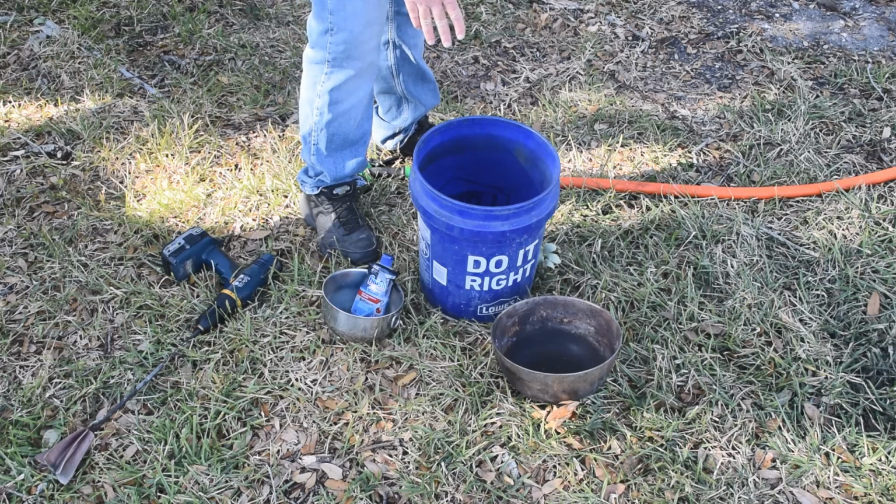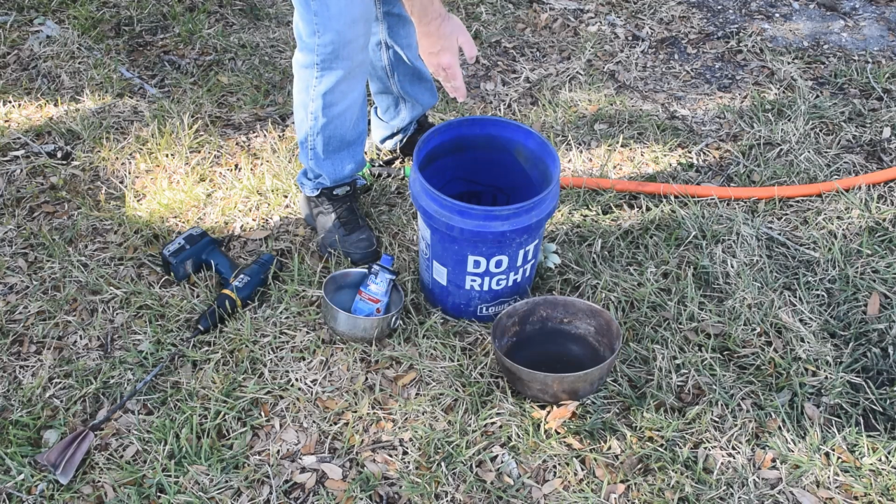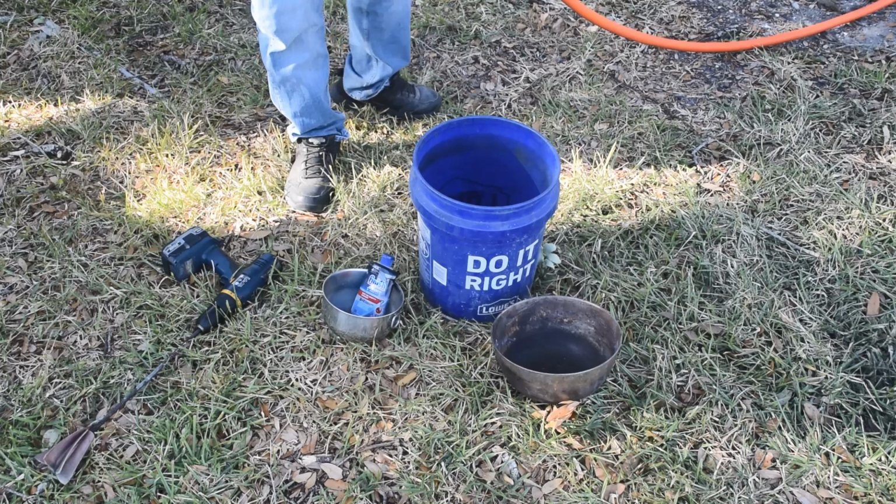The first few times, there's so much ash in here that we're going to have a really thick slurry, and the metal is going to take a while to settle through that slurry. So I don't want to pour it off too quick. I want to be patient. I want to give the metal a chance to settle.